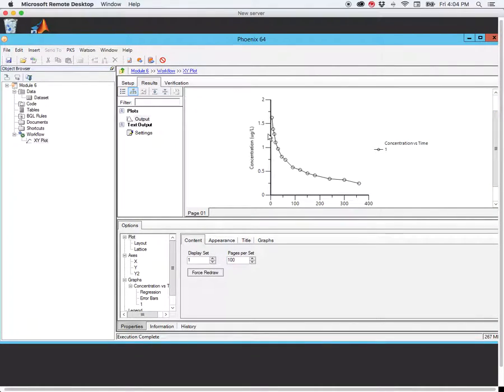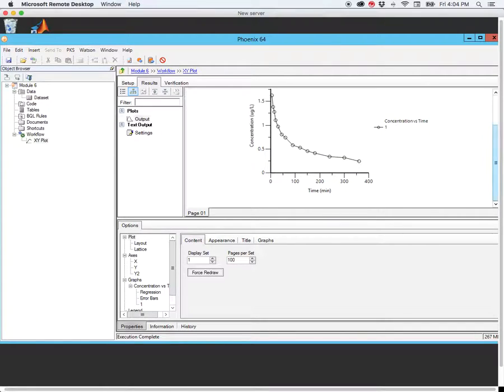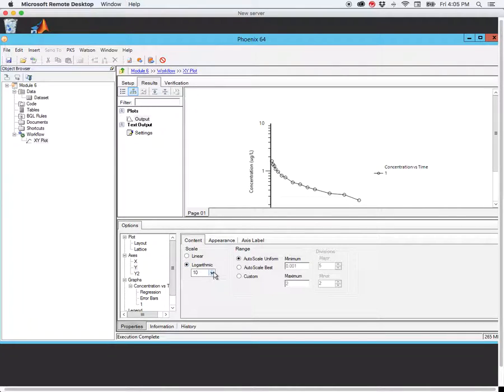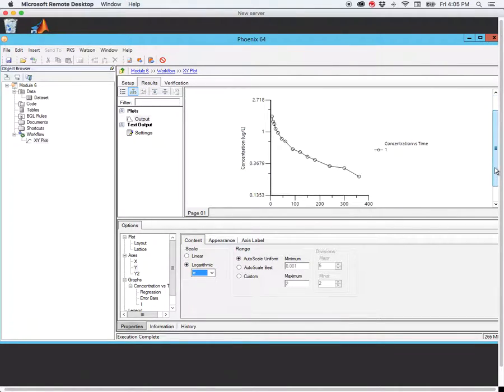Here we have our data. We can see that there doesn't seem to be anything amiss — we have time versus our concentration. This time concentration profile seems to have a pretty steep portion here and then it becomes less steep here. So it's not a smooth exponential decay; there seems to be a difference between this initial portion of the curve and that later portion. We can also transform the Y axis to a logarithmic scale, and that gives us a better sense if there is truly a difference in the slopes between the initial and the terminal portions. This is our first clue that maybe a one-compartment model is not the correct model for these data.